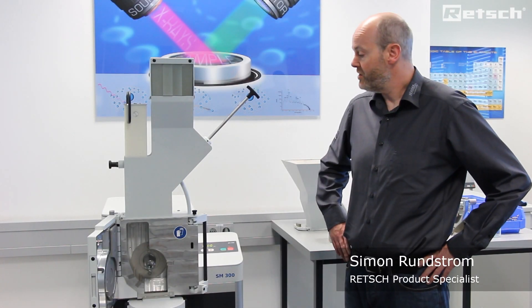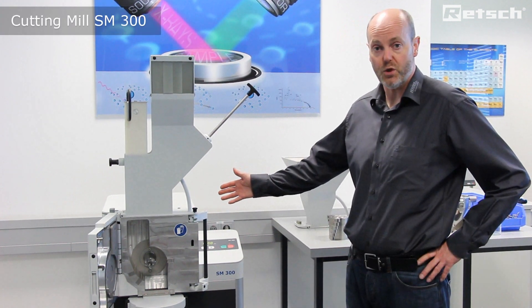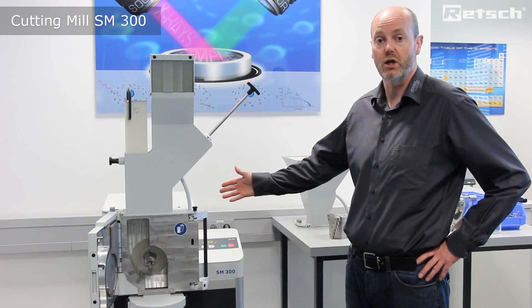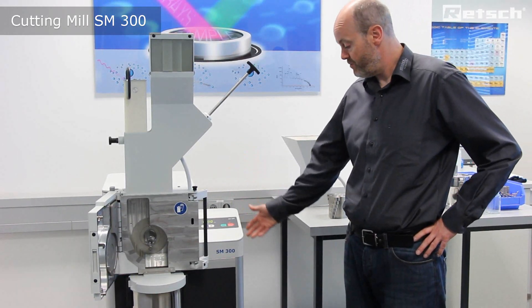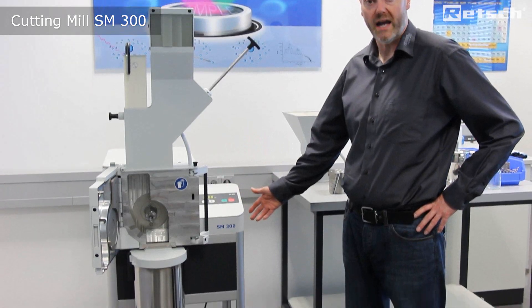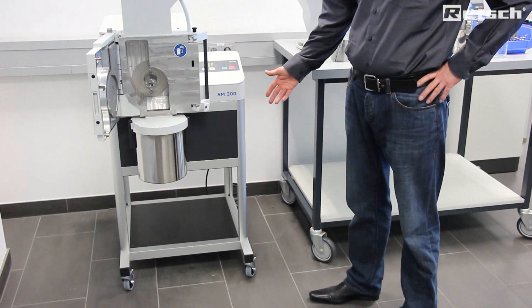Hello. I'd like to take this opportunity to introduce the floor-mounted SM300 variable speed cutting mill. As you can see, the instrument is mounted on a frame with four casters, the front two of which are lockable for extra stability.